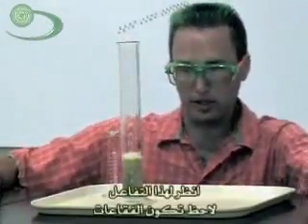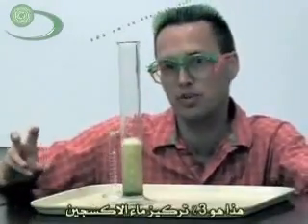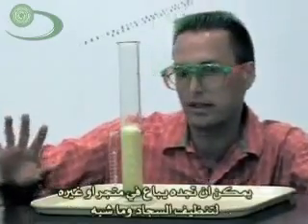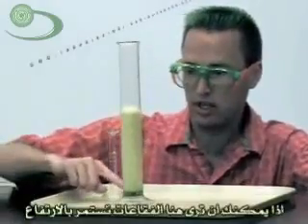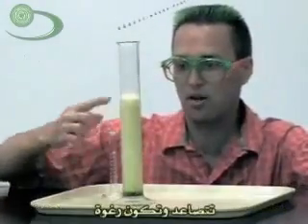Oh yeah, look, there it is. It's bubbling. Ooh, bubbling away. Now this is 3% hydrogen peroxide. What you could buy at the store if you want to clean out a cut or something like that. Be careful with hydrogen peroxide because it gives off oxygen gas. So you can see here it goes. It's still bubbling off. Oxygen gas is coming out in a little foam.